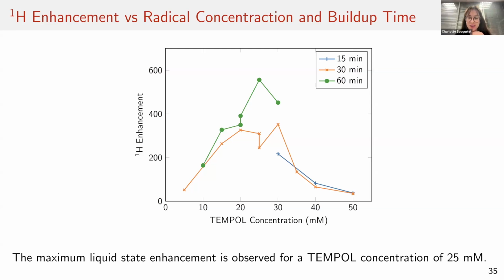There is another question from Diganta. How fast does the bullet travel in the transfer line? Do you have a value of speed? Yes, this is something we measured early on. Actually, we measured that before we did DNP, because we were transferring samples for other purposes. And we noticed they were traveling quite fast. So we took 2 optical detectors and we mounted them on a piece of aluminum 30 centimeters apart, and we measured, and it took 4 milliseconds, if I recall correctly.